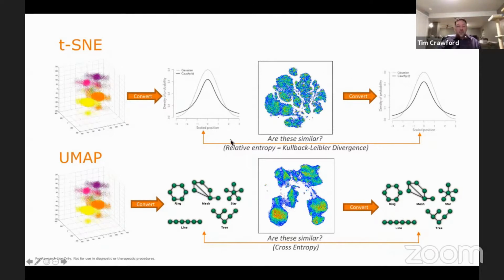And it will do that 1,000 times. T-SNE will find nearest neighbors, push and pull, convert and compare. Find nearest neighbors, push and pull, convert and compare. Until finally you get this resolved low dimensional embedding, this visualization that has all the events in 2 dimensions that you can mine and use as a visual aid to convey a message to your audience.